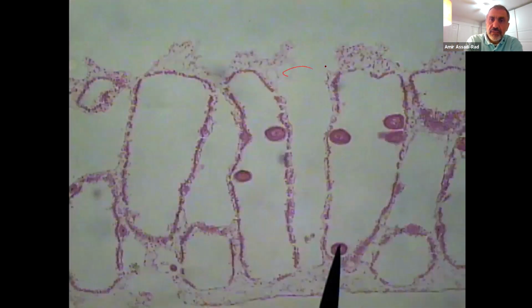So again, ostium, and these would be mesoglial layer. All of the amoebocytes. I might ask, what is the name of the cell in here? It would be amoebocytes. And the name of the cells on the surface are pinacocytes. If the pointer is here, that would be pinacocytes. Amphiblastula, and the cells right here are choanocytes. And the cells here are also pinacocytes. And the cells in here are amoebocytes or archaeocytes. And the layer here would be the mesoglial layer or mesenchyme.